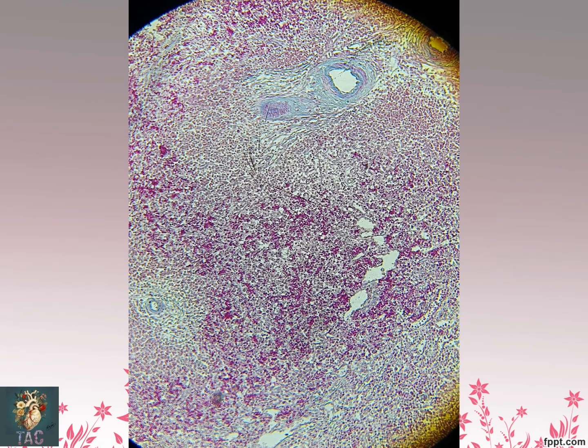Another slide for the spleen, and in this slide this whole area is the white pulp. This all is the white pulp.